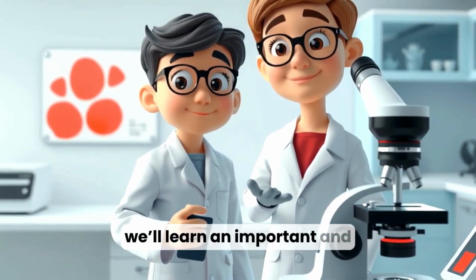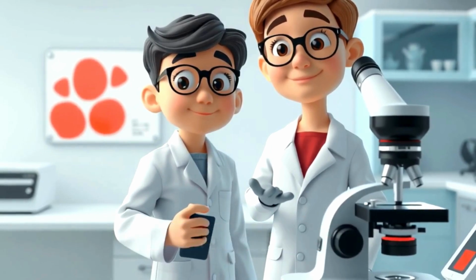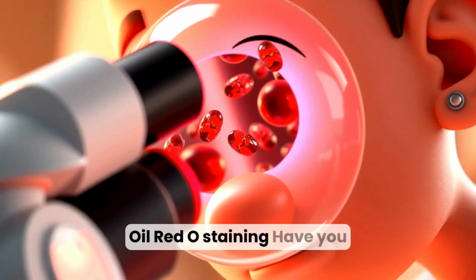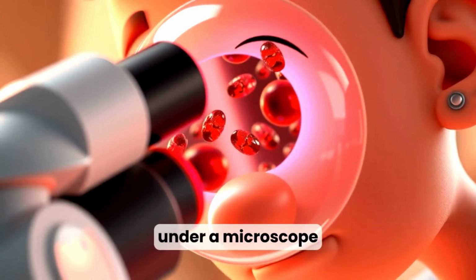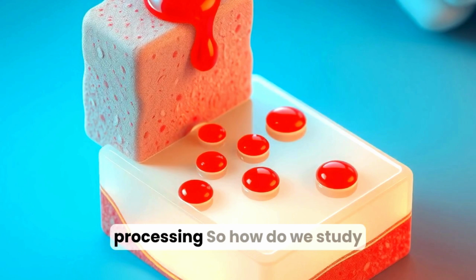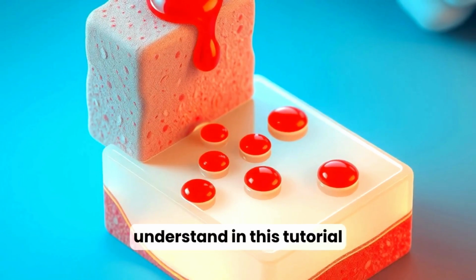Today we'll learn an important and very practical topic from histology and cytology, lipid staining. Specifically, we'll focus on oil red O staining. Have you ever wondered how we can actually see fats inside cells under a microscope? In routine histology, lipids often disappear during processing. So how do we study them? That's exactly what we'll understand in this tutorial.